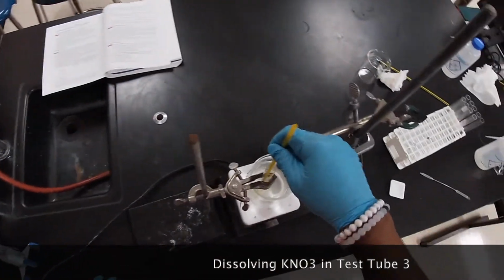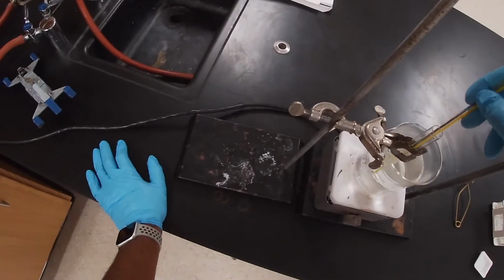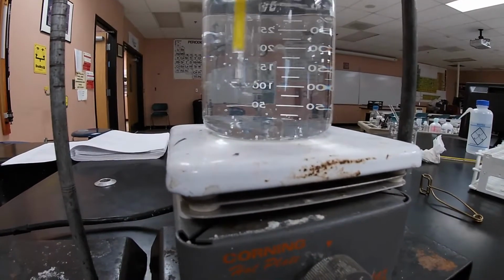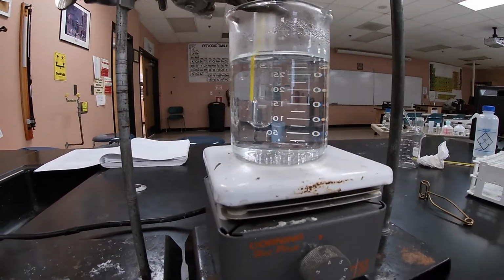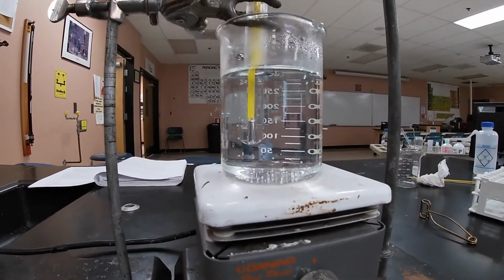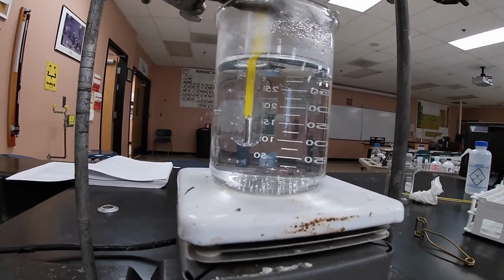Okay, we're almost done mixing. We're almost done dissolving our salt. I'm going to give you, hopefully you can see right there, we're almost done with the dissolving of the 5 grams of potassium nitrate into our 5 milliliter test tube. As you can see, we are done dissolving all our potassium nitrate. So now all I'm going to do is take it out of the water bath and allow it to cool so that we can determine the temperature that it crystallizes.